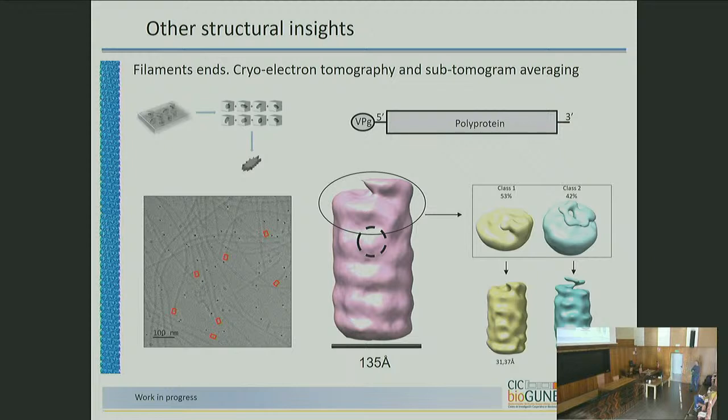But at least we have evaluated the technique, and the type of result we have. We collected those images in a 200 kV microscope, which is even worse. So we know what to do in the next step.